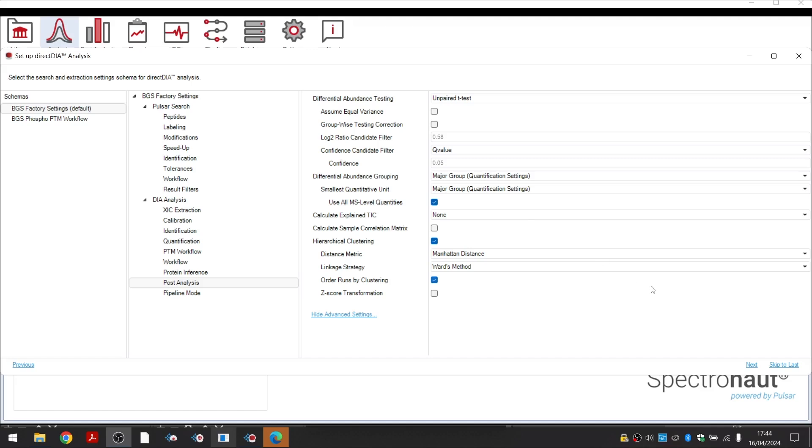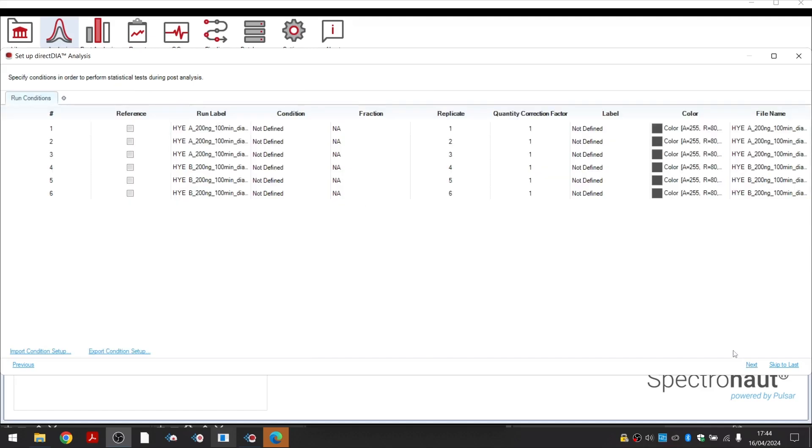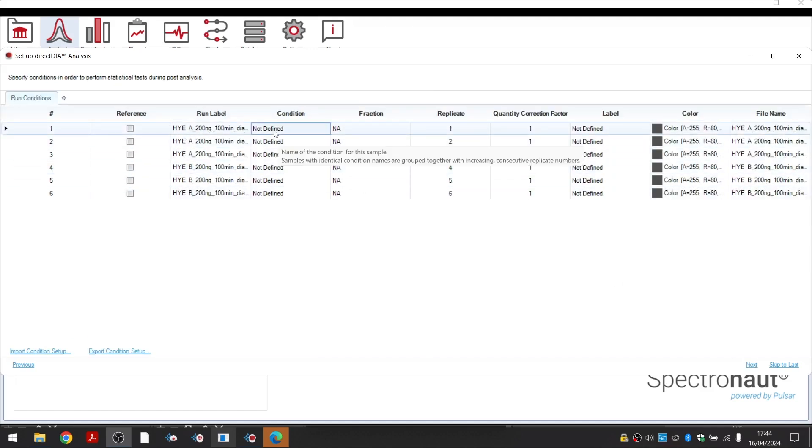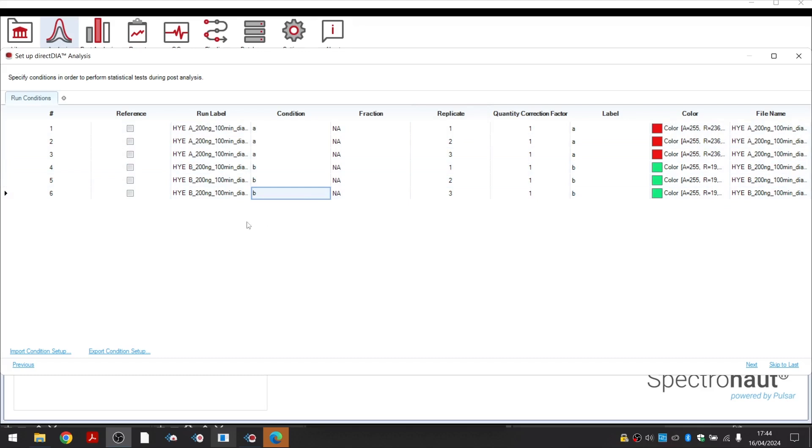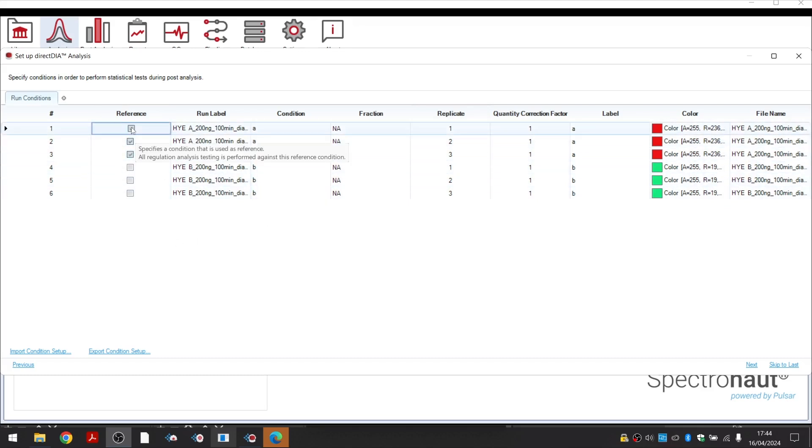In the condition setup, you can define which runs correspond to a particular experimental condition. By selecting a reference condition, we can define the numerator and denominator for the protein fold change calculation.